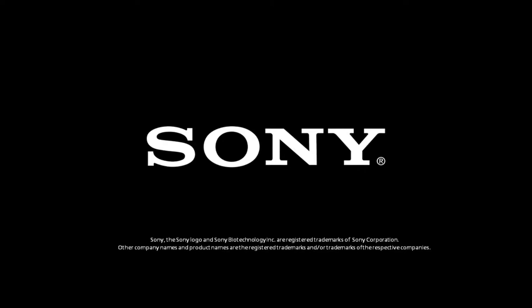Our first question is, does the Sony sorting chip get saturated after running one experiment? What if I want to use the chip for the entire day for sorting?